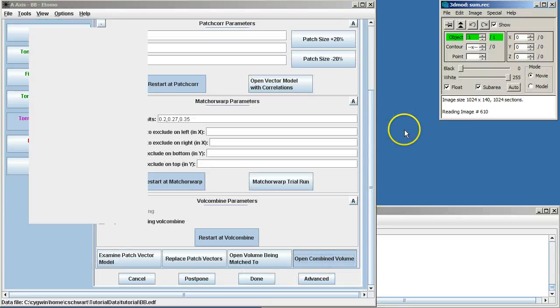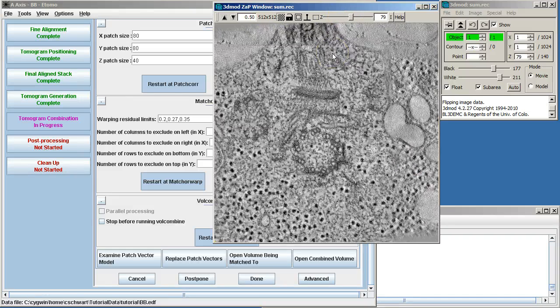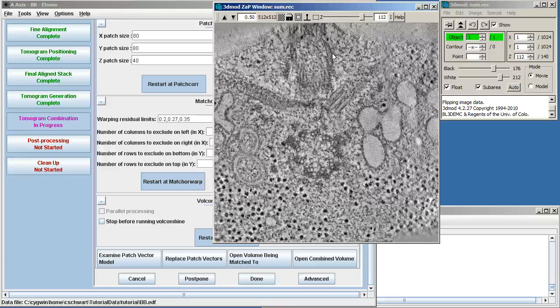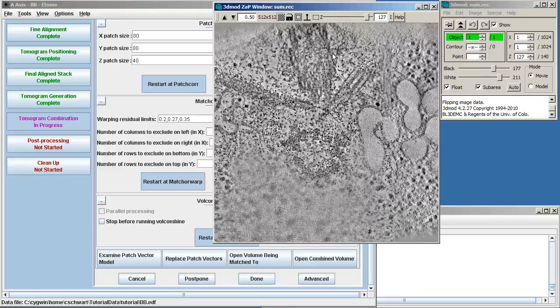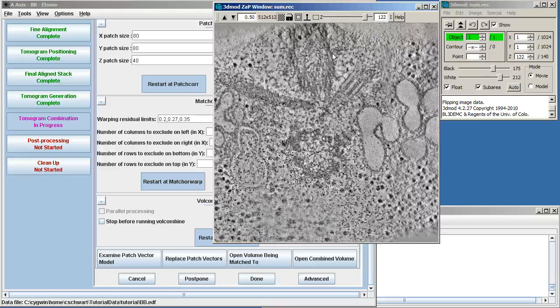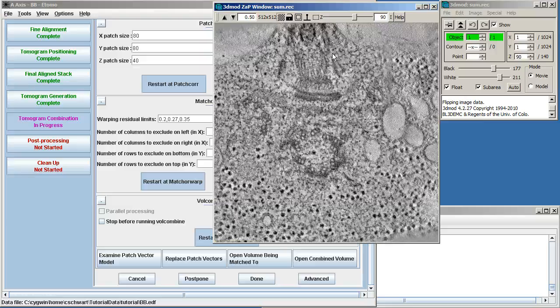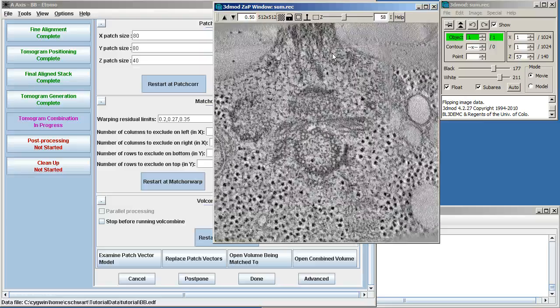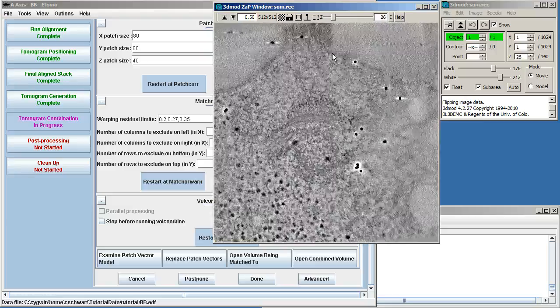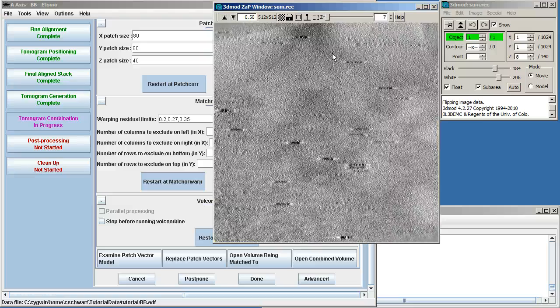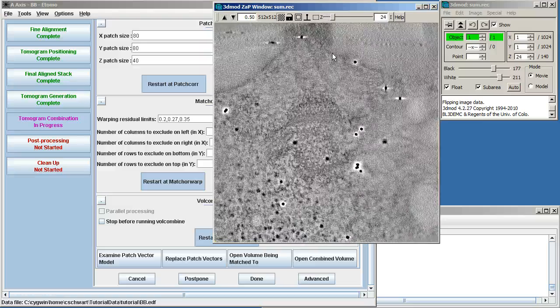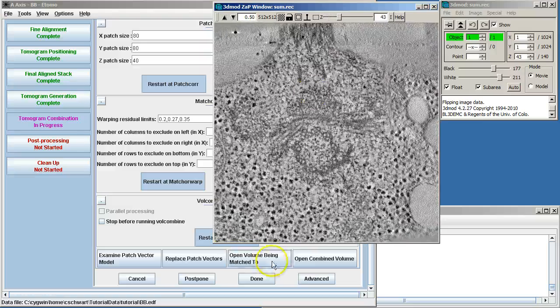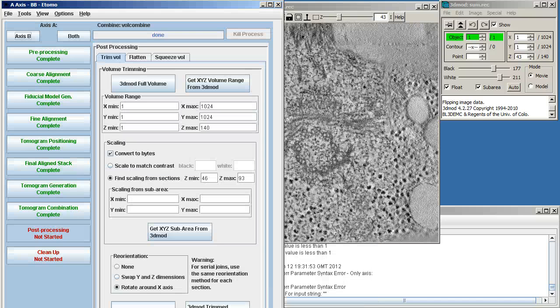So now we can open the combined volume. Here you'll see the tomogram itself on the right and top edges. That's where it's single axis where the A and B axes didn't match quite right. And in the middle is where it's more like a dual axis. So everything looks good. We can say done.